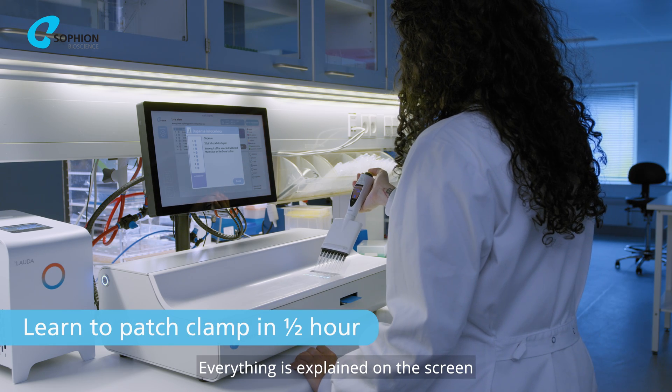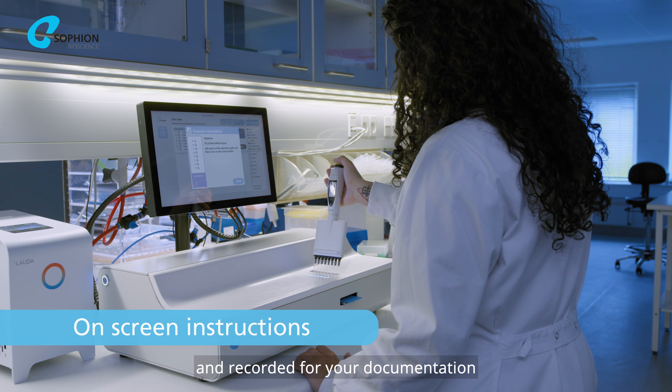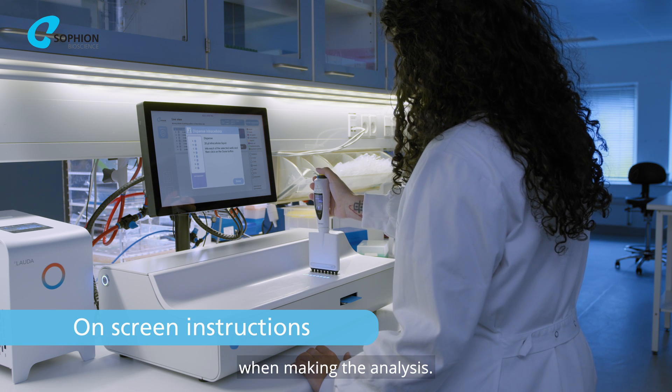Everything is explained on the screen and recorded for your documentation when making the analysis.